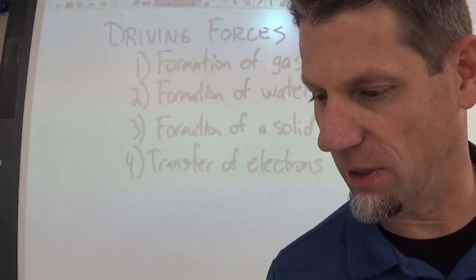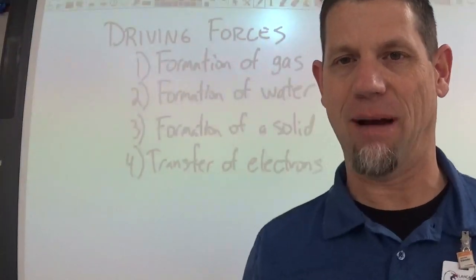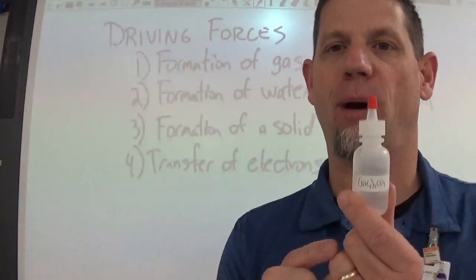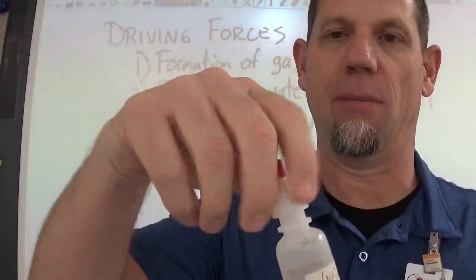Let me see what it says on my instructions. It says no more than 4 drops. I would say like 5 or 8 might be okay. You don't want to go crazy because we don't want to use up all of the materials. The 4th type of dropper bottle has this little red lid. If you were to unscrew this, it opens the entire thing and you will dump out all of our chemicals.